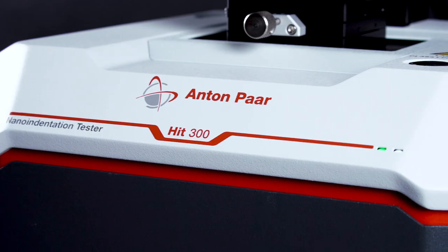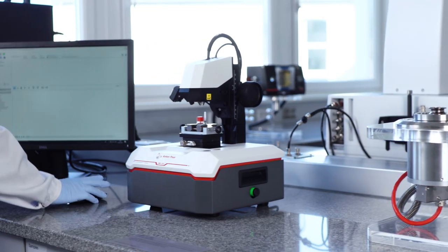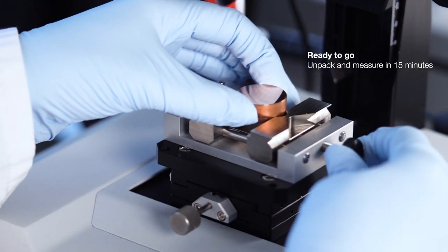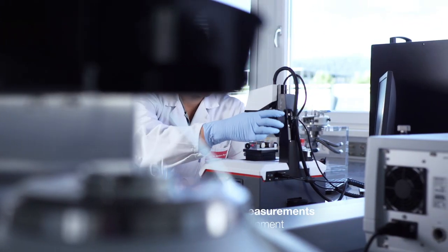It is always at your side, up and running in just 15 minutes. A real high performer. Take it with you wherever you want.